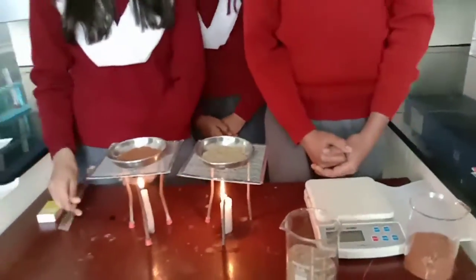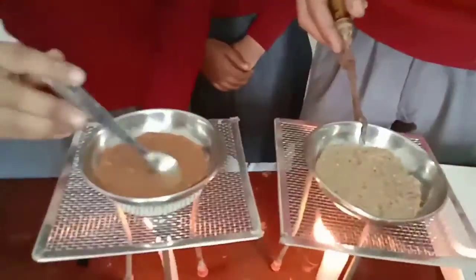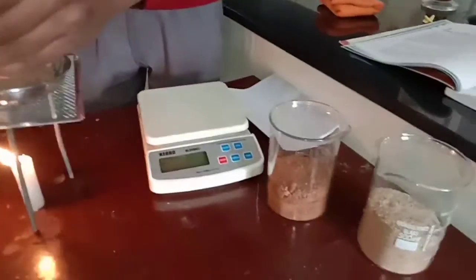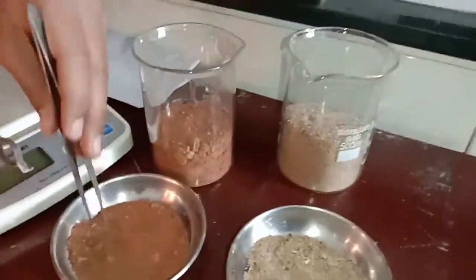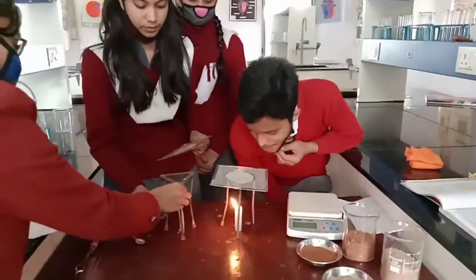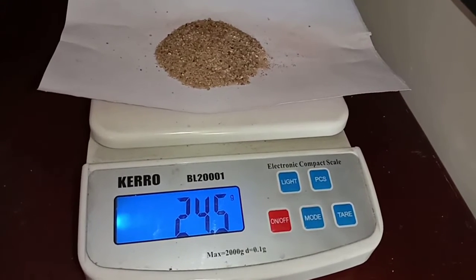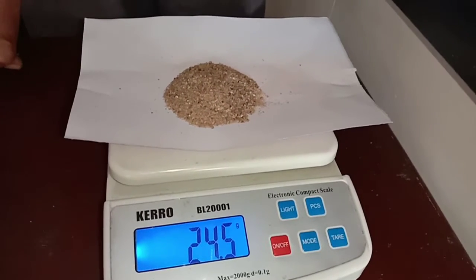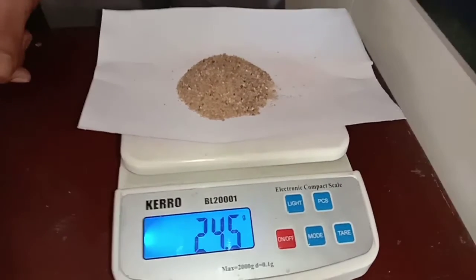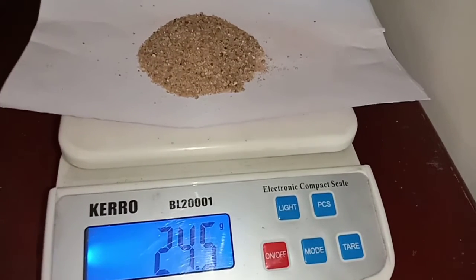After that, we'll take the help of a holder and we'll keep our heated soil sample on one side of the table. We'll let it cool down for 5 to 10 minutes. After that, we will again weigh the dry soil sample and record the weight of the dry soil sample. This is the final reading. The samples are now ready to be used to determine the moisture content of the soil.